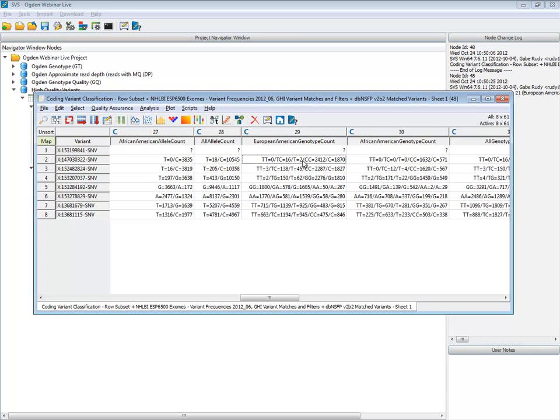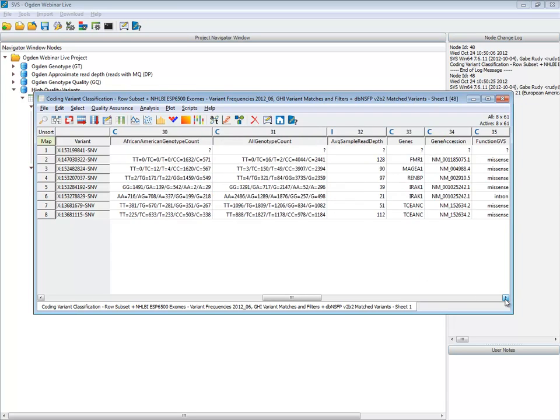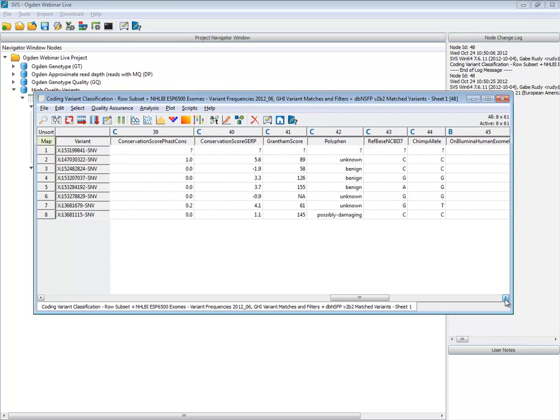So if you have a variant present in 2 males that made it to the age of being in the study, unlikely, in fact, pretty much rules out this as a potential variant for this disease. You're not going to have that variant that's going to cause this infant death also be present in healthy adults in the hemizygous state. So let's go ahead and scroll over some more to that functional prediction stuff.